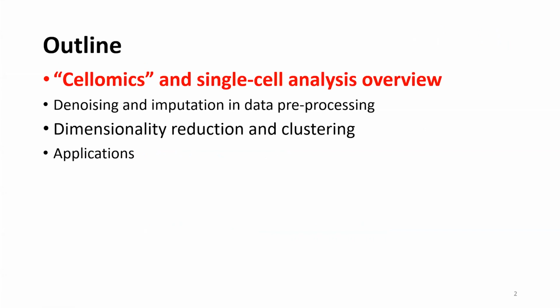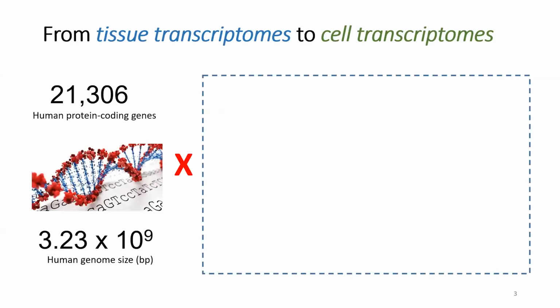Then dimensionality reduction and clustering. And last, I will talk about applications. It's not meant to be comprehensive, because nobody can do a lot in 20 minutes. It's meant to get your feet wet and get you interested in what single-cell analysis is all about.